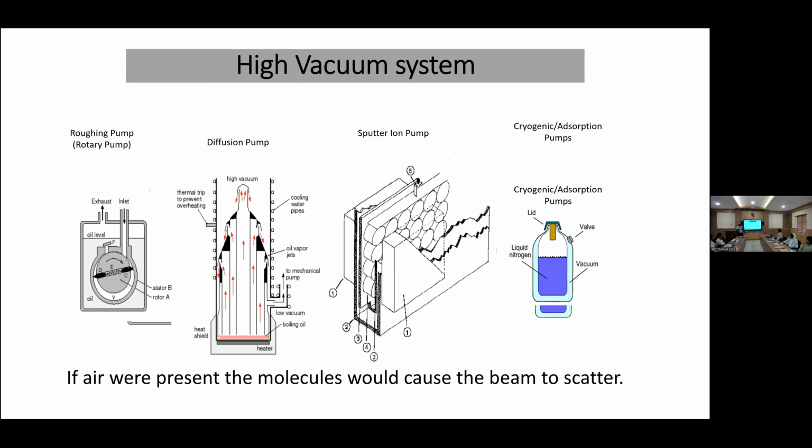So if we use the microscope in very bad condition, the life of this pump depends on the handling. If there is more contamination, the life of the pump is reduced, because it sputter coats on this, and the more coating there is, the lower the efficiency. It pumps from 10⁻⁵ to 10⁻⁸. Okay. So this is a high vacuum system inside the TEM.